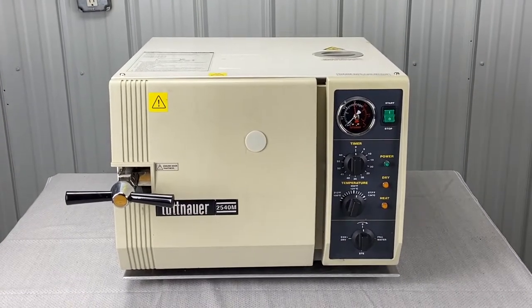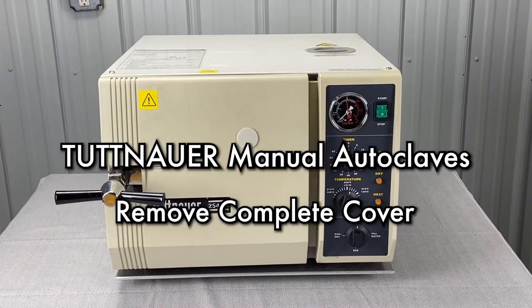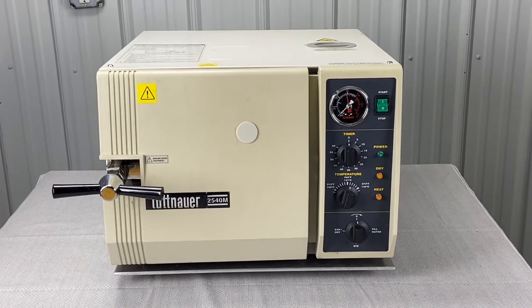What we're going to do here — we're looking at a Tuttnauer 2540M. We are going to show you how to take the cover off of most of the Tuttnauer models, manual units and automatic units. They're pretty much the same.